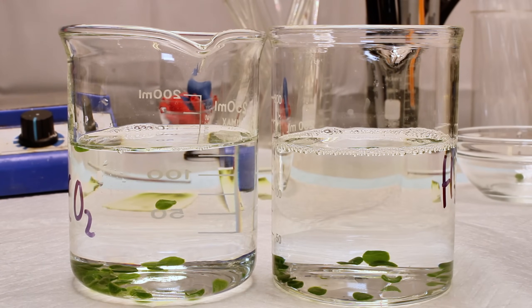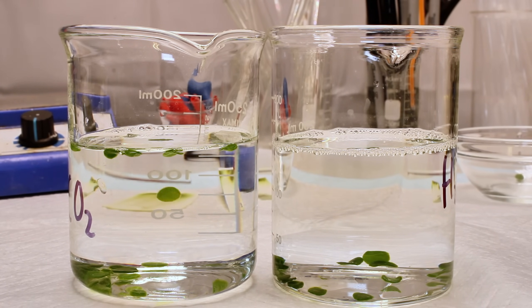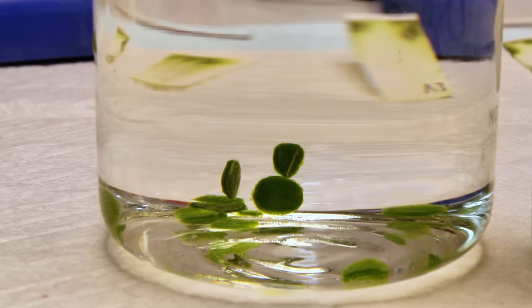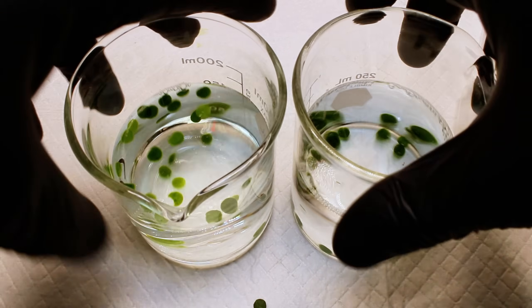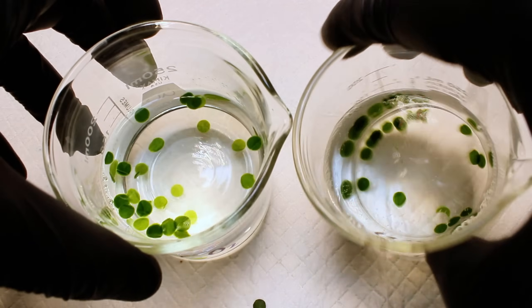This is because the leaf discs in the bicarbonate water have access to all the ingredients for photosynthesis — water, light, and carbon dioxide — while the leaf discs in the water beaker only have access to light and water. As a result, the leaf discs in the bicarbonate beaker undergo rigorous photosynthesis, which generates not only the target glucose, but also oxygen gas, which causes them to gain buoyancy and float to the surface. As a side note, this strategy can also be used to help flower cuttings live a lot longer.